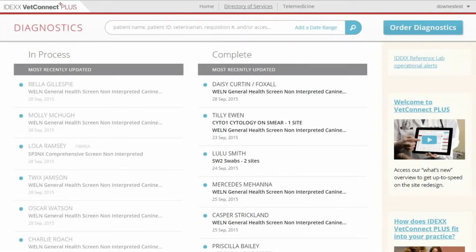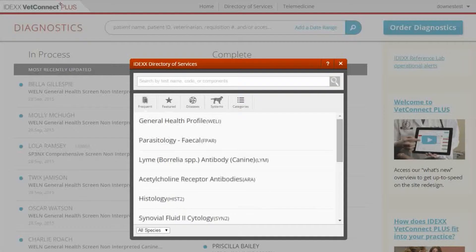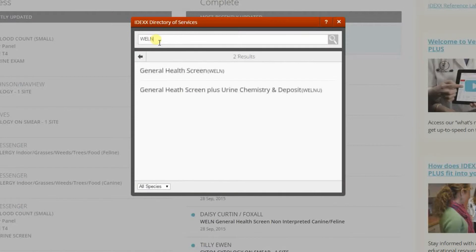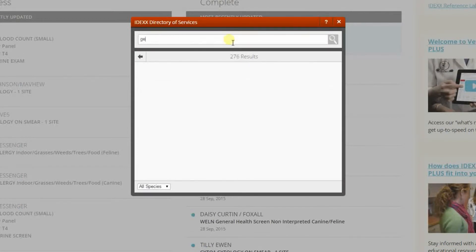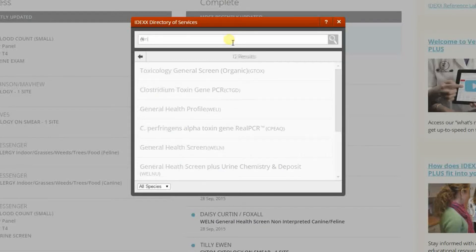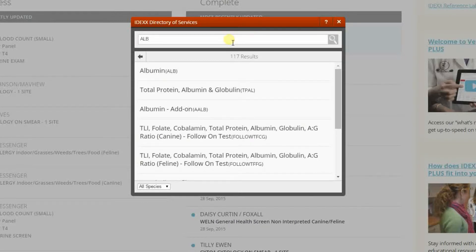After you log on to VetConnect Plus, you can search for diagnostic tests using the online directory of services. You can search by test name, test code, or test components such as SDMA or T4, and even by synonym like antifreeze for the ethylene glycol test.